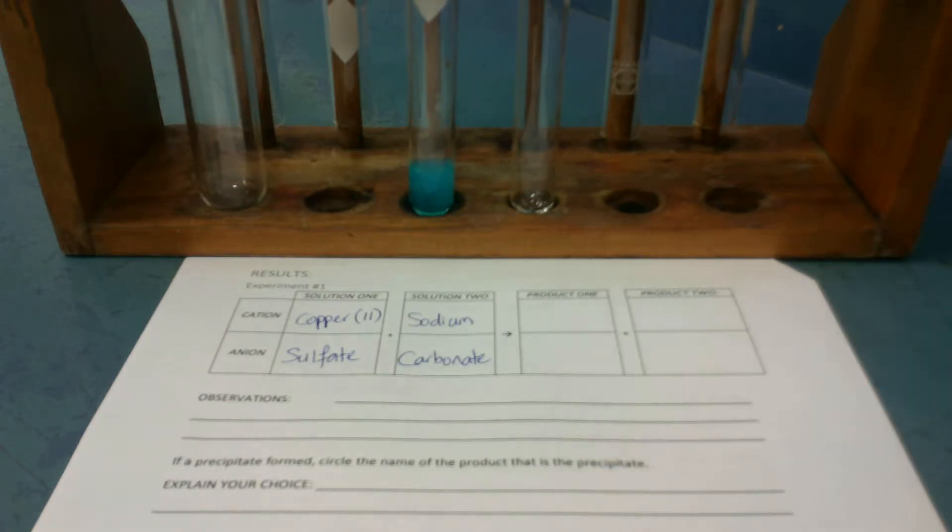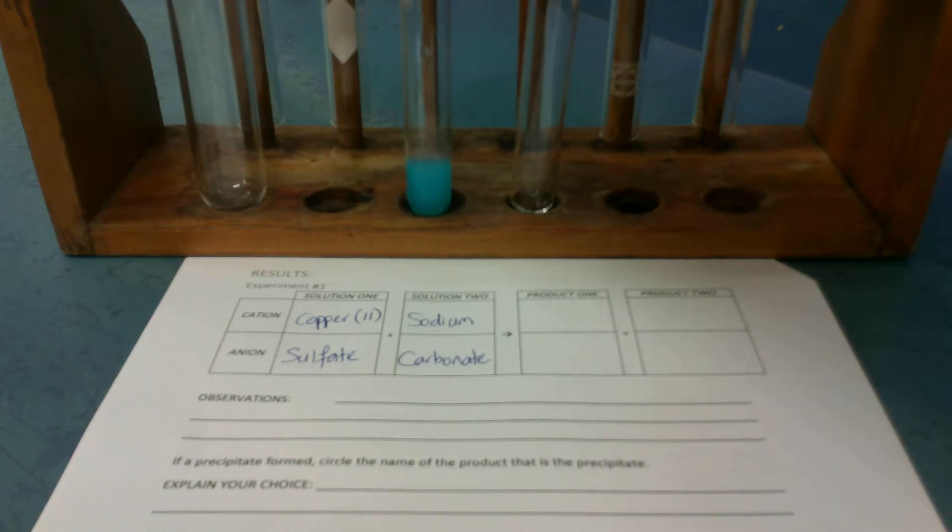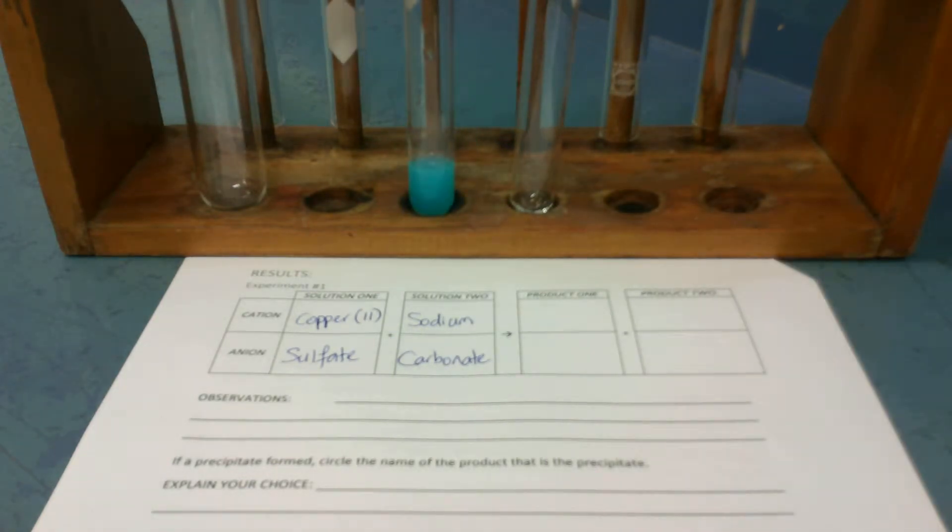So there we go. And we see that it goes a bit cloudy. So that means it's made a solid. So it's going from two solutions, clear things, to having it go cloudy, which means there is a precipitate. So we know there is a precipitate.